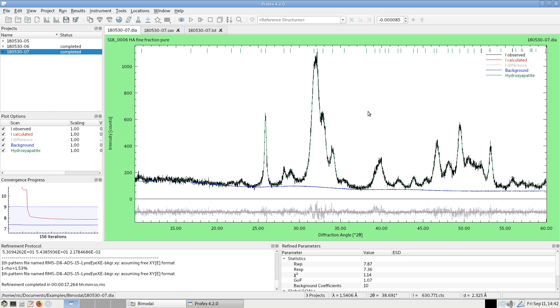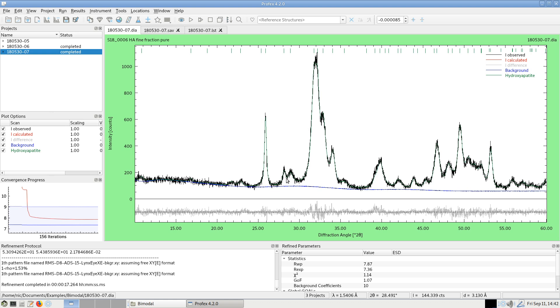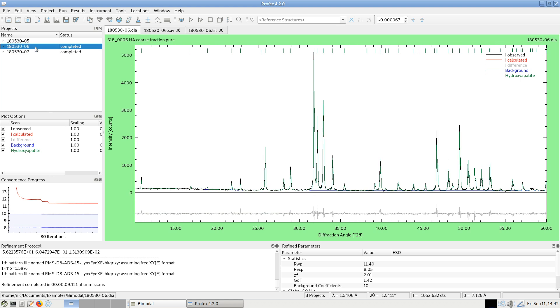In both cases the refinement algorithm was perfectly able to refine the shape of the peaks very well. We can see a very good fit of the shape here in the nanocrystalline sample and there's almost no signal in the difference curve and also a pretty good fit, not perfect, but fairly good in case of the highly crystalline sample.